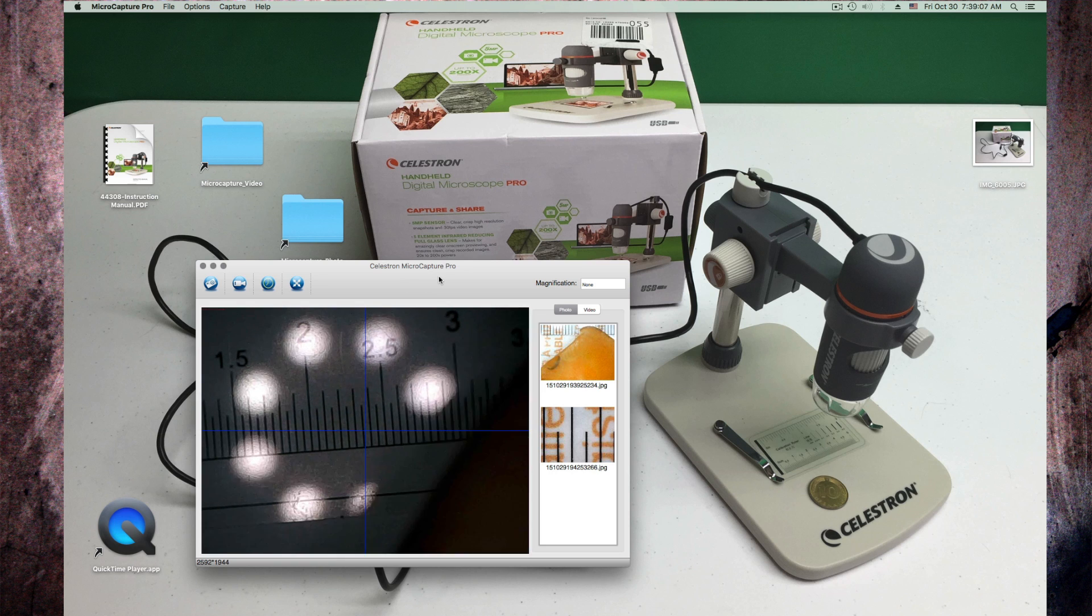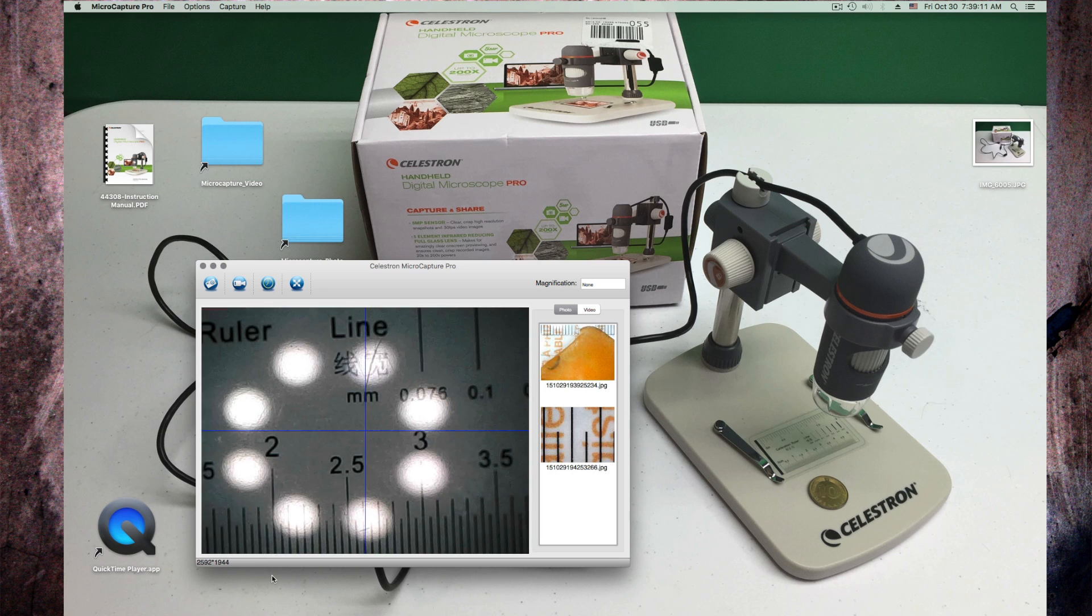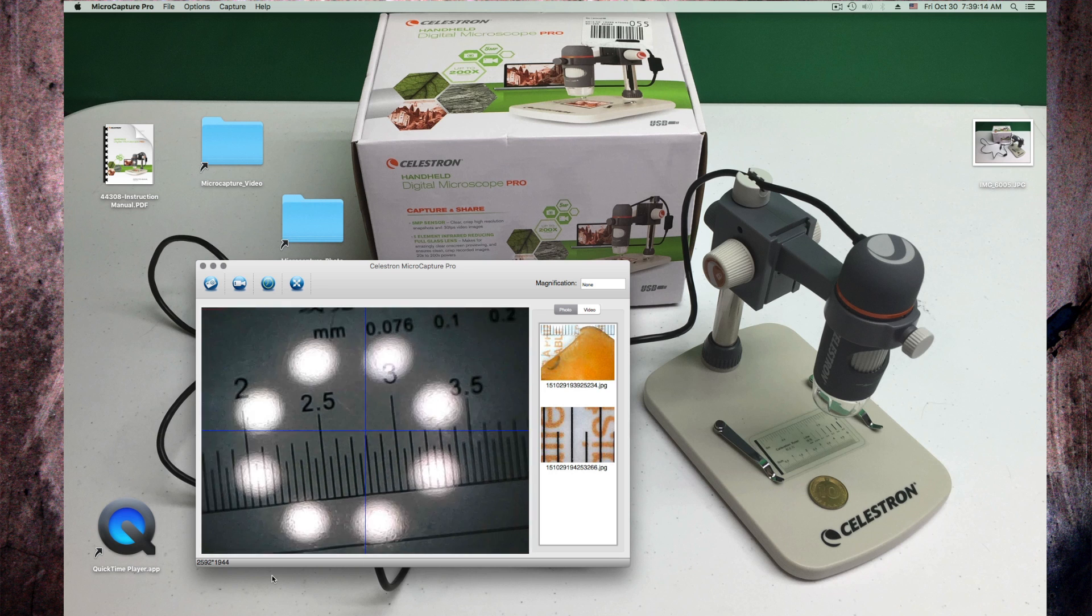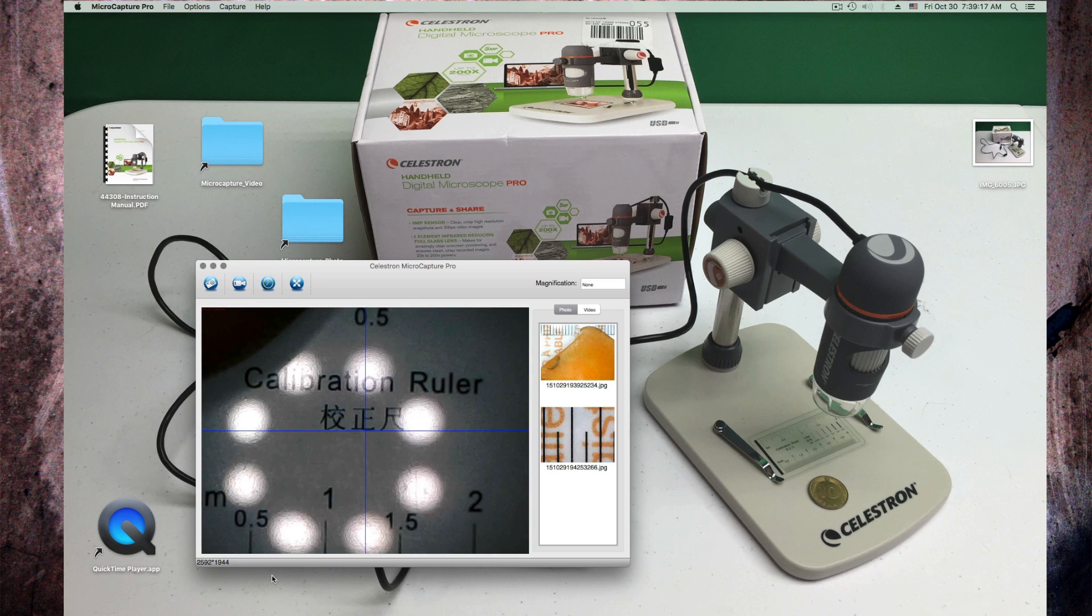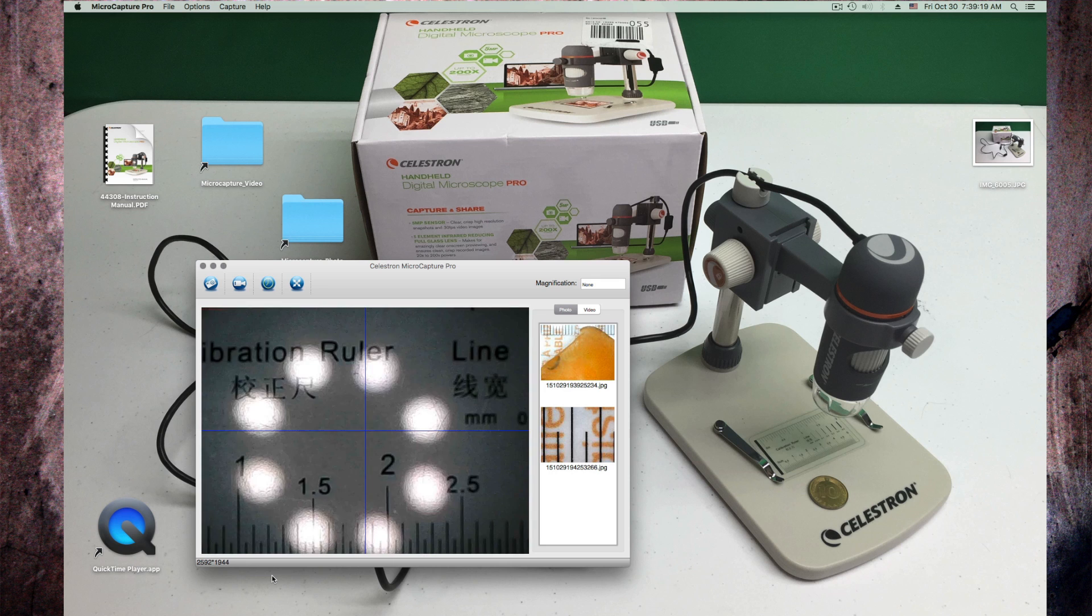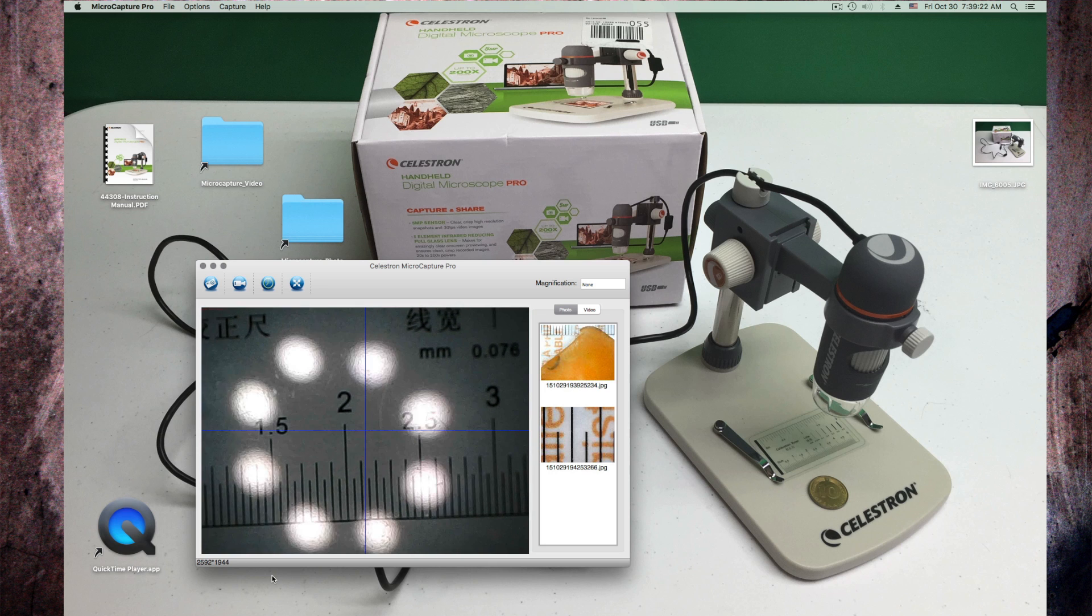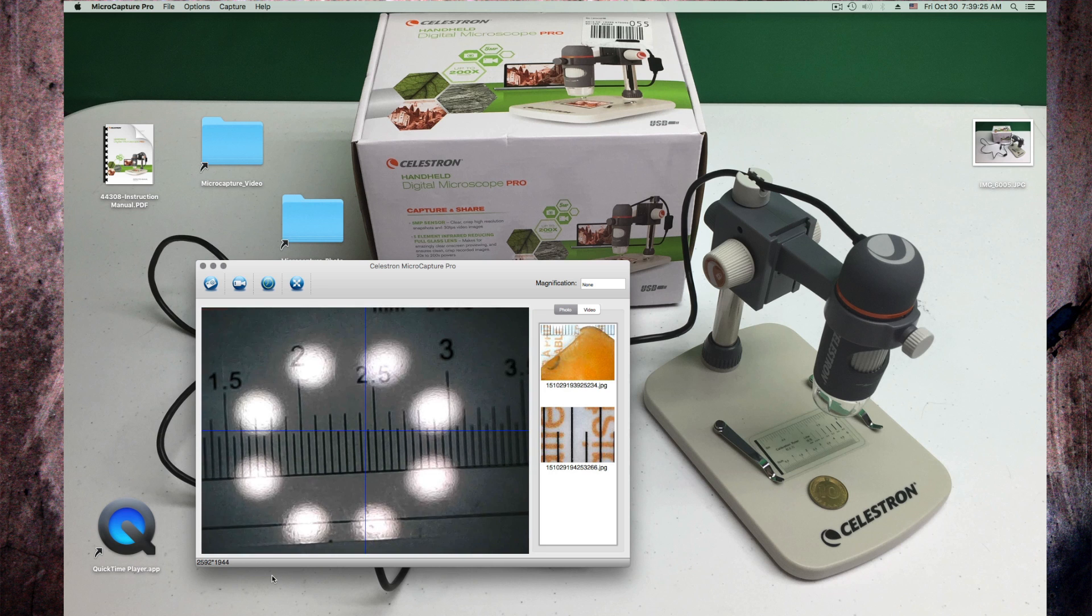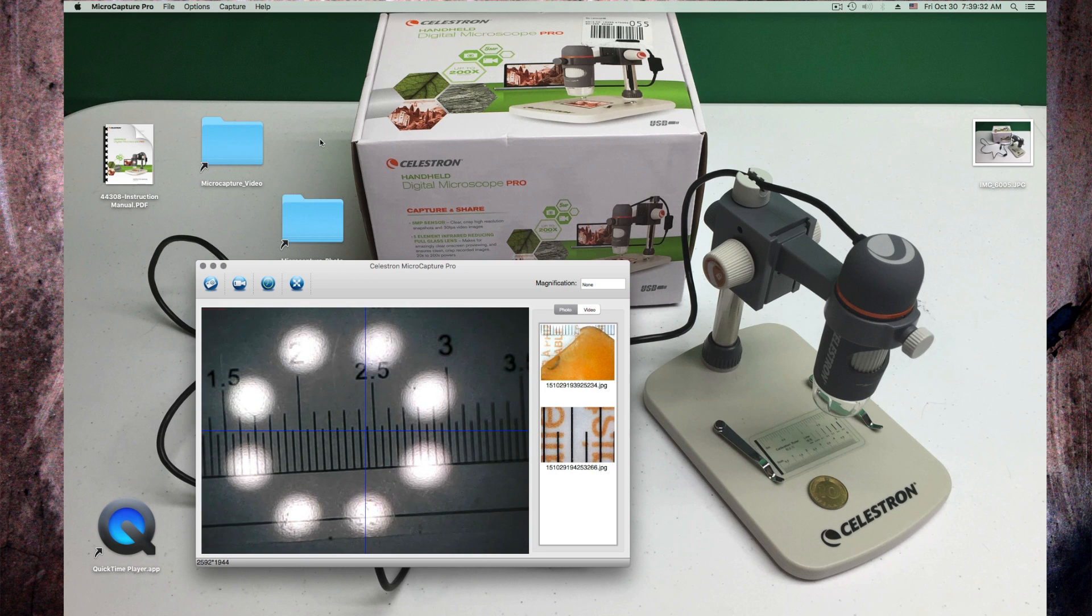I can push the escape button to go back to the regular window here. We see the reflections from the LEDs in plastic, glass, or whatever. So this here is the calibration ruler, and there I can calibrate how close I can get in here. Let's put this over here to the side. When I drag and drop, not really very responsive.